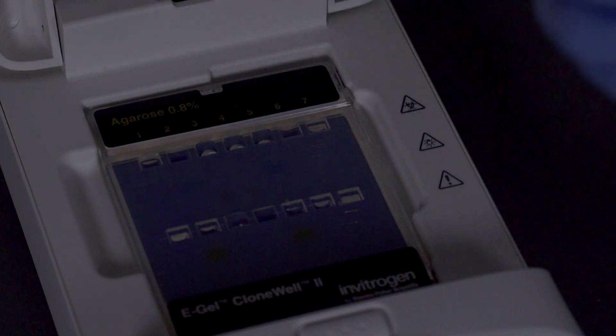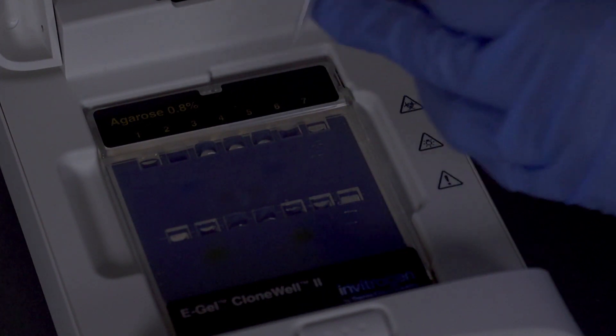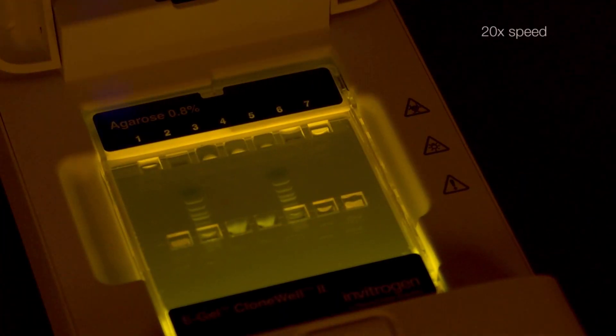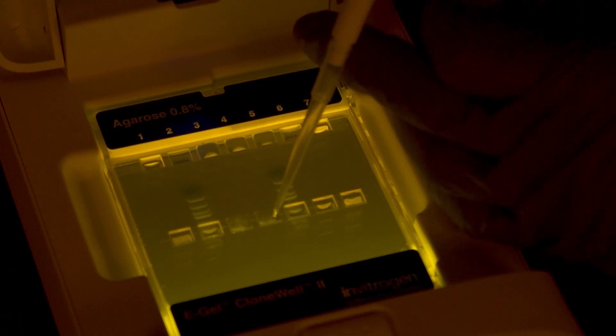Add 40 microliters of water to the recovery wells. Resume the run and carefully observe as the band of interest enters the recovery well. Stop the gel and recover the sample with a pipette.